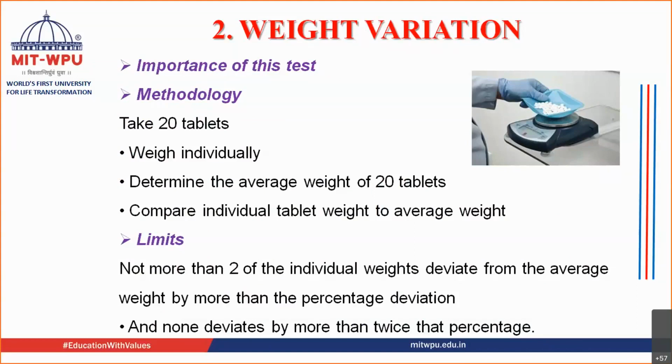If the weight of the tablet is less, then you can predict that the amount of active ingredient going inside the tablet is also maybe less. You cannot confirm it. That can be confirmed only with the content uniformity. But there is always a possibility.